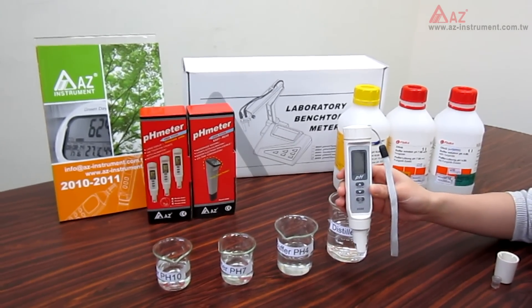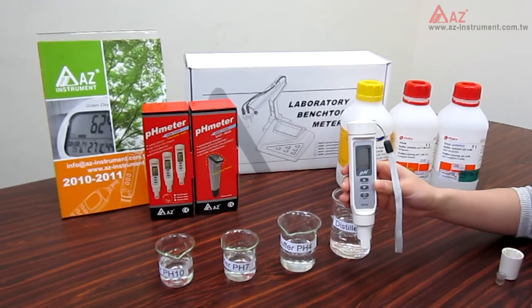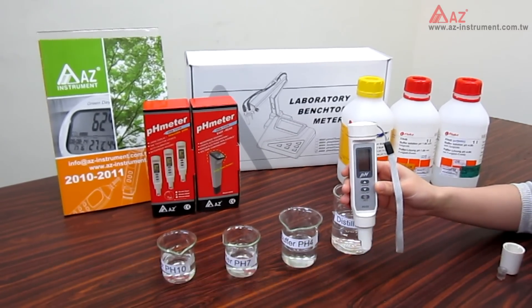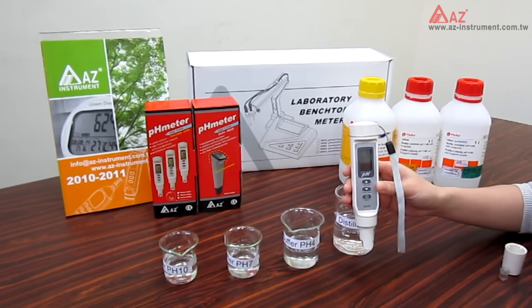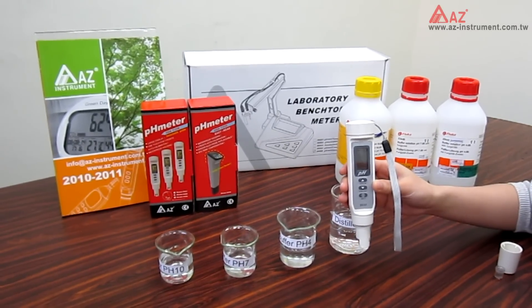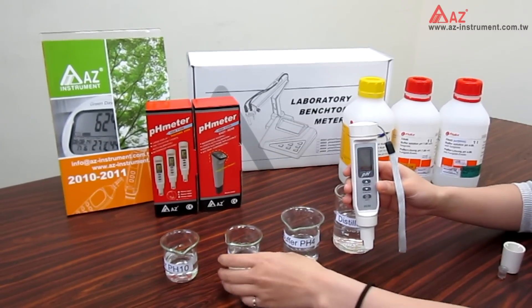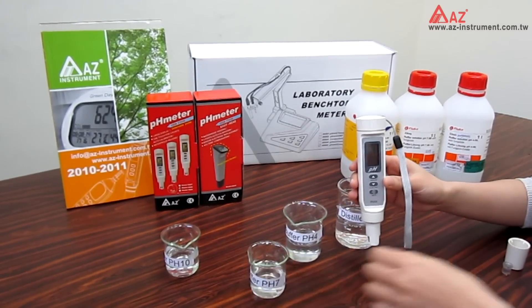To prepare for the calibration, you need to have the standard buffer — pH 4, 7, and 10 — and also distilled water for rinsing the electrode during calibration. It is suggested to start with pH 7 calibration first, then pH 4 and 10.